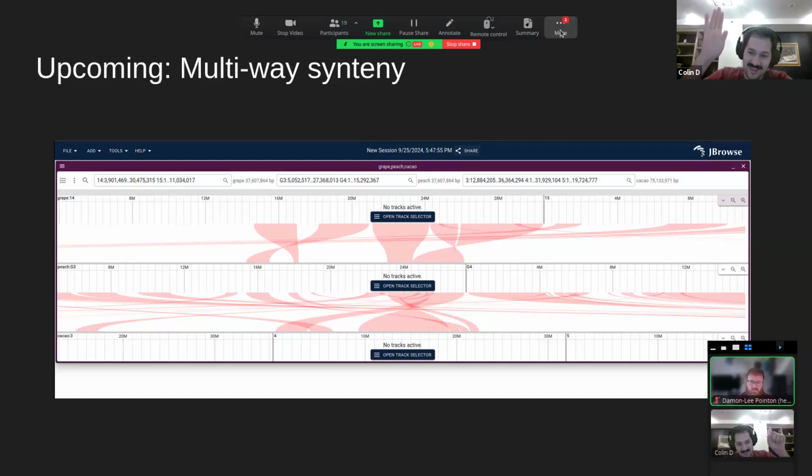You highlight the protein and it shows you on the genome. And the cool thing is, AlphaFold DB predicted 3D proteins for everything in UniProt, so a lot of stuff. So you can basically automatically do that for anything that they did, or you can load your own. I'm just going deep into this side project I've been in. Or you can load your own protein that you predicted on ColabFold or whatnot, and it'll work with that as well.